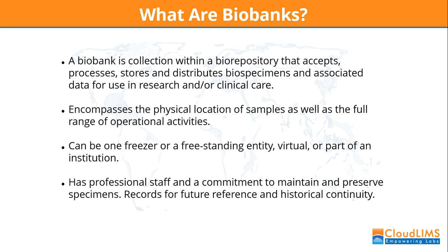Now we'll look at what biobanks are and how they relate to a biorepository. A biobank itself is a distinct collection of tissues and the associated research data that goes with those tissues. The role of the biorepository is to house these collections and to keep the tissues in a safe physical location where researchers can query the tissues and access the data associated with them.